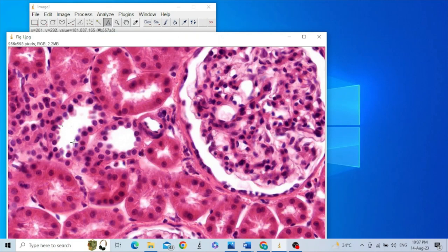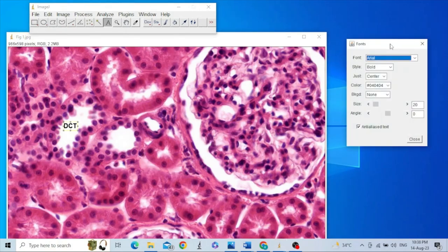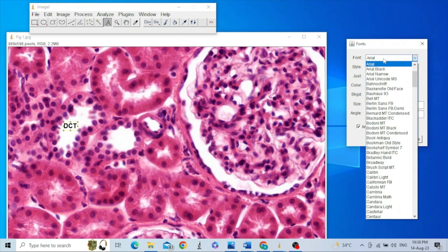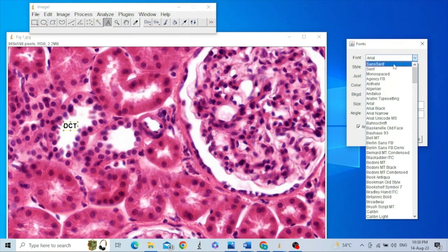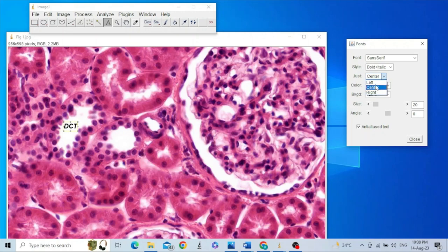We can label all these parts. For that purpose, just click on the Text Tool and click where you want to put your text — for example, type 'distal convoluted tubule'. You can move it around and edit it. For editing, double-click on the Text Tool to open a dialog box where you can change the font from Arial to sans-serif, and the style from bold to plain or bold plus italic. The text may be aligned to the left, right, or center.